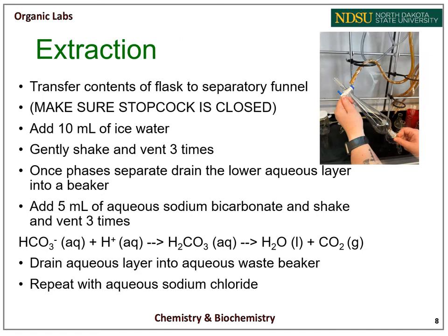Once your mixture has cooled, you are now able to perform a liquid-liquid extraction. You should be familiar with extractions from the caffeine lab. An extraction is when you're pulling out a desired species from one solvent to another, whereas washing is when you're removing impurities from a phase with your desired species. Today's case will be considered a wash.